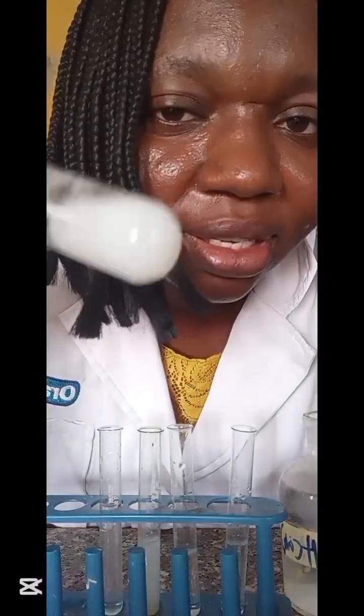A white gelatinous precipitate. You can see how it is, not so white, sticky. So this is what?